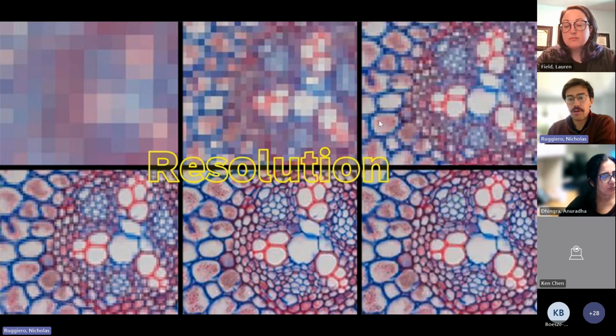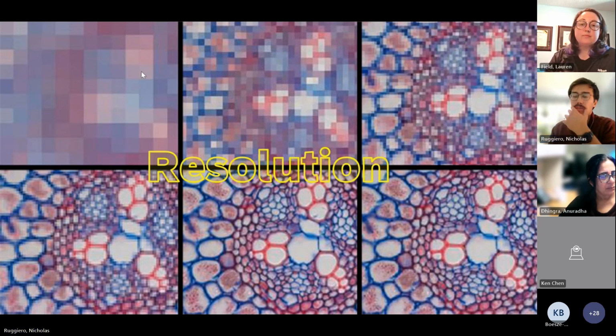This one's pretty straightforward. We have an image here of some structural little cavities. Our bottom right image is going to be our highest resolution image, and our top left image is going to be our lowest resolution image. For this, we're going to say that we want to measure these small cavities within our image. If we look at the bottom right image, this looks really great. We'd really easily be able to segment these objects out, measure the area, do all sorts of stuff.